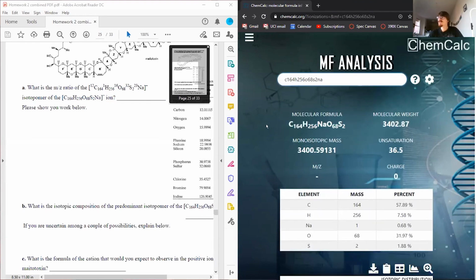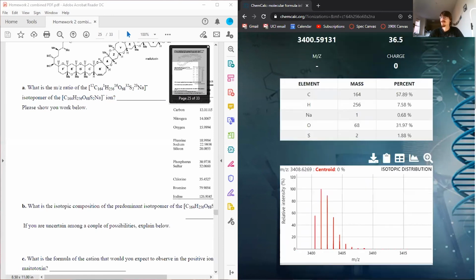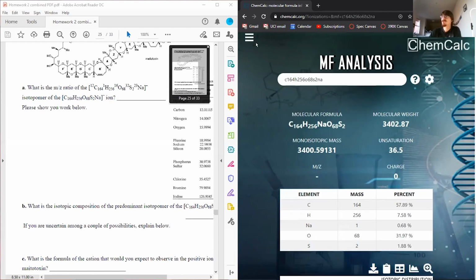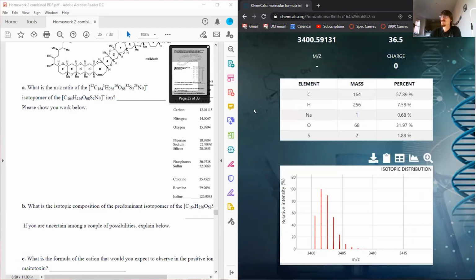So when you say you used the molecular formula finder, do you mean you typed in the molecular formula in order to see the isotopic distribution? Yes. Okay. In case anyone in the discussion was unaware of this function, in addition to the tab that allows you to type in an exact mass and it will give you a formula, you can type in a formula and it will give you an isotopic distribution that includes all of the statistics of relative abundances. And so, Anastasia, what you're mentioning is that this most abundant ion appears to be the M+1.